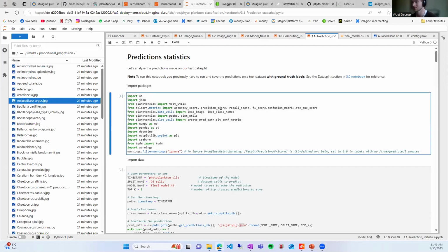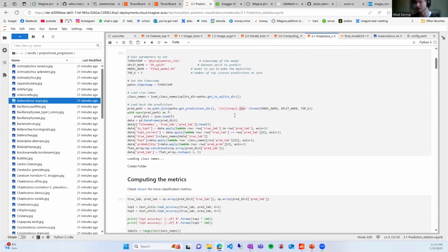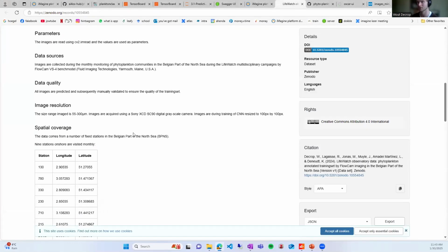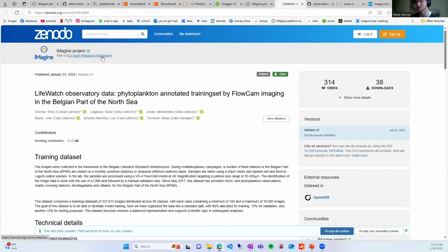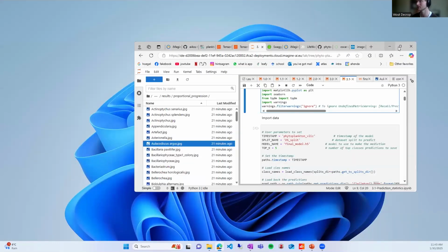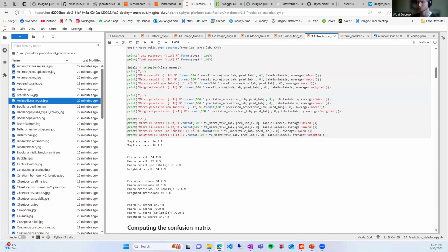So we check here in the statistics, at the end for our test data set, how the model performs. For the training it can be really good, but you always have to have an independent test data set. And we just made the split. Our training data set has around 95 classes. And we have explained it here about the coordinates and everything. Then we have a random split going around all these classes and making 10% of all the data independent. And then for this independent data, we can see if the true label, or ground truth, matches the most confident prediction, or if it's not the most confident, the second or the third, to see how well the model is performing. There is a specification or refinement, so the quality control of the right image classification.